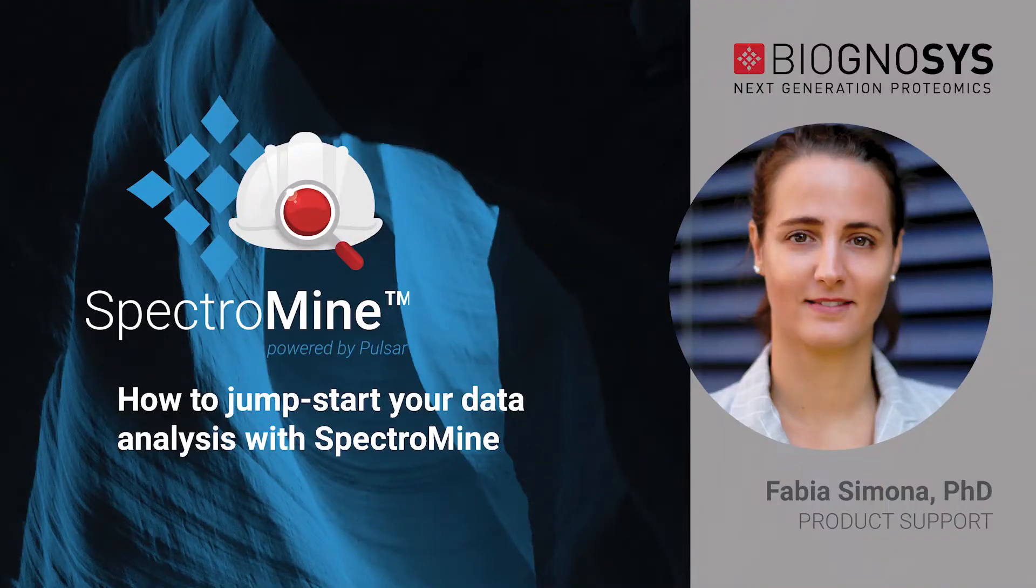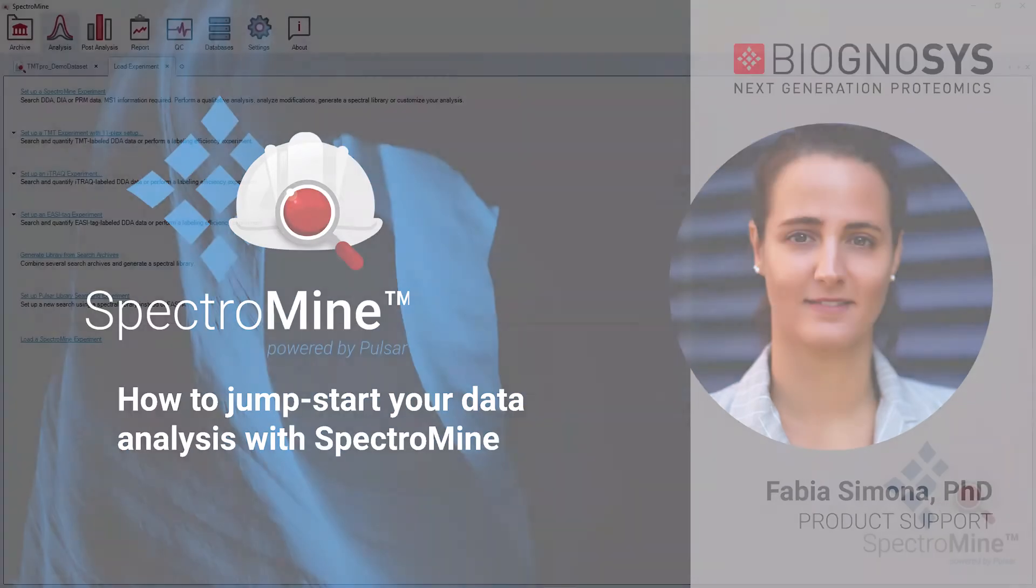Hi, here is Fabia from the Biognosys product support team and today I would like to show you how to jumpstart your data analysis with SpectroMine.